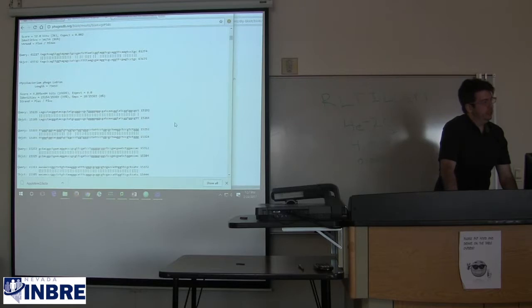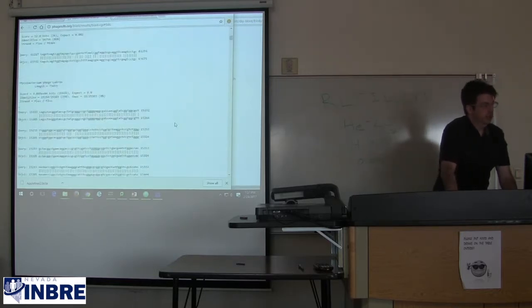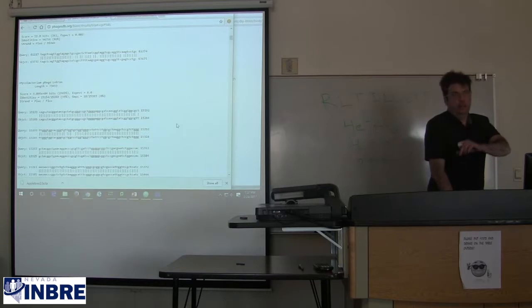If you scroll up slightly, you can see some of the secondary alignments between Apple Tree 2 and itself, from regions of ancient duplication or whatever that are not perfectly conserved, sort of chatter that's left over. And if you remember from some of the very earliest slides about local alignment, just because we got hits for the complete sequence doesn't preclude us from getting local alignments of subregions in the reverse orientation.